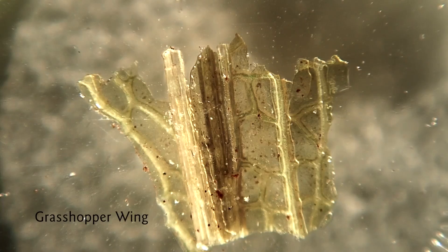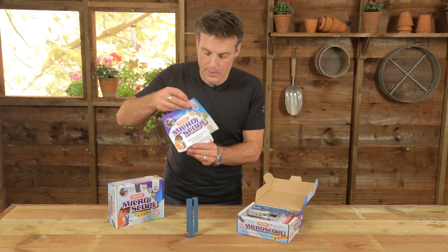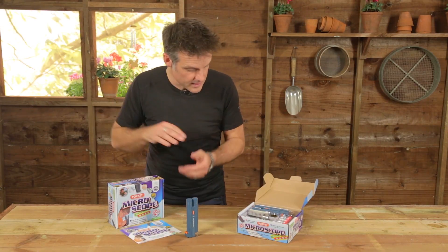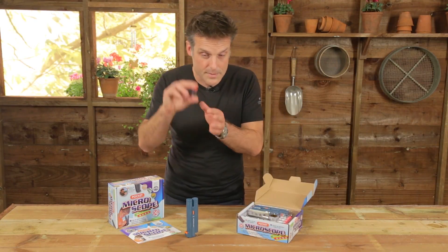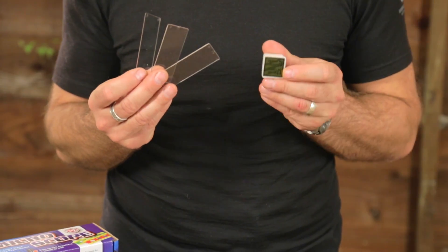The magic again is in the subject that you choose to put under it. To help you in your quest, we've got a booklet — like all my kits, it comes with a booklet to show you how to get the most out of your microscope and how to use it effectively. The kit also comes with lots of little vials for you to collect your specimens in, a bunch of slides, and some little covers so you can make up your own presentation slides.